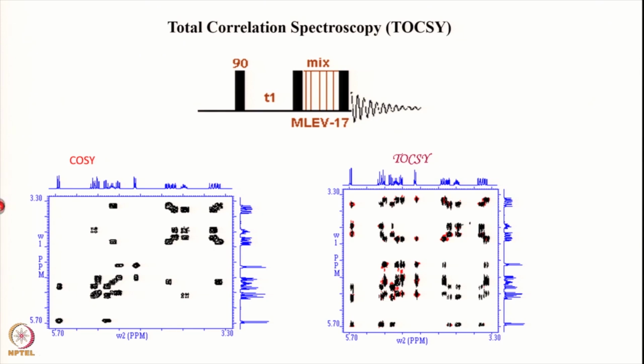Analysis of the COSY spectrum in a complex system. See, you could not identify this from the one dimensional spectrum. This one dimensional spectrum would not allow you to identify all these correlations, which proton is coupled to which proton. Both of these are proton spectra, okay. On both axes we have the proton frequencies. So from the one dimensional spectrum you cannot figure out which one is coupled to what. But in this COSY spectrum you can figure out the entire network of couplings by monitoring where the cross peaks are.